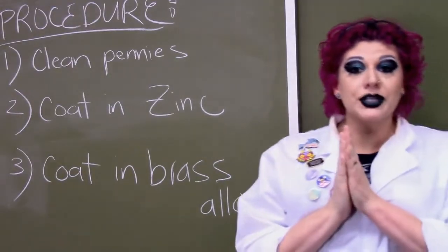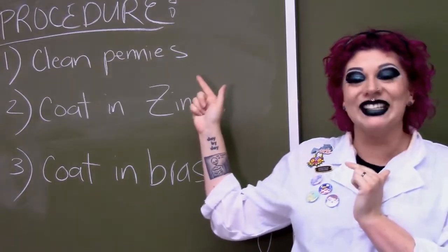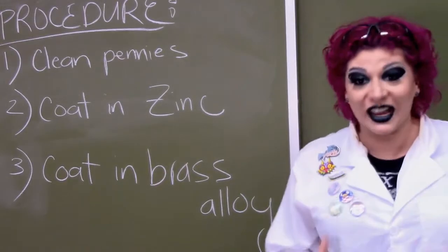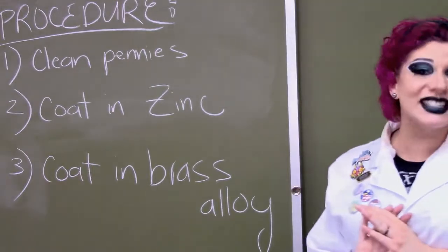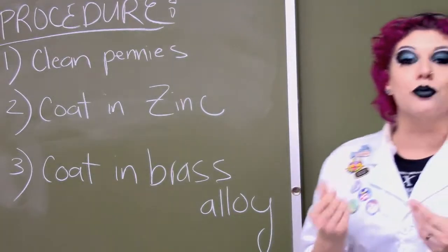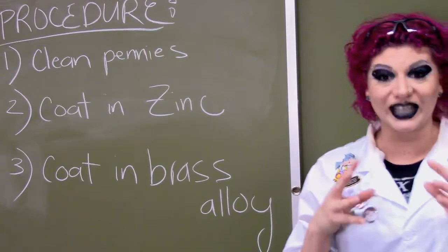Here is the rough procedure for today's experiment. First up, we need to actually clean the pennies. These are pretty gross, and we need to clean the surface off so that the chemical reaction can actually take place. Then we will coat our pennies in zinc, giving it that nice silver look. And then we're actually going to turn that coat of zinc into a brass alloy. So that is what's going to give our nice gold color.